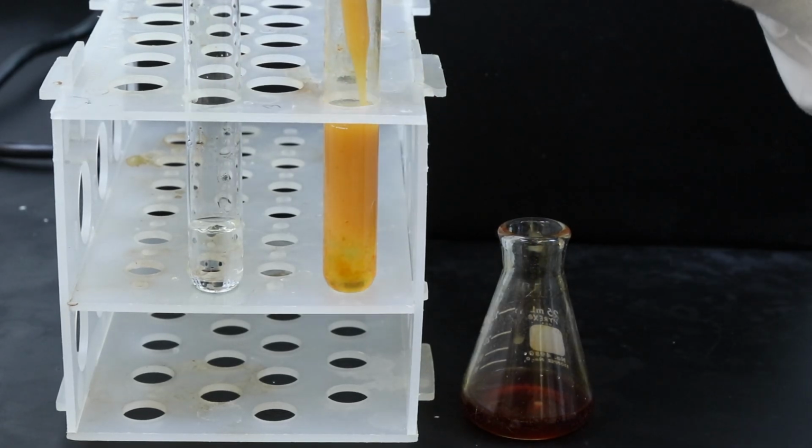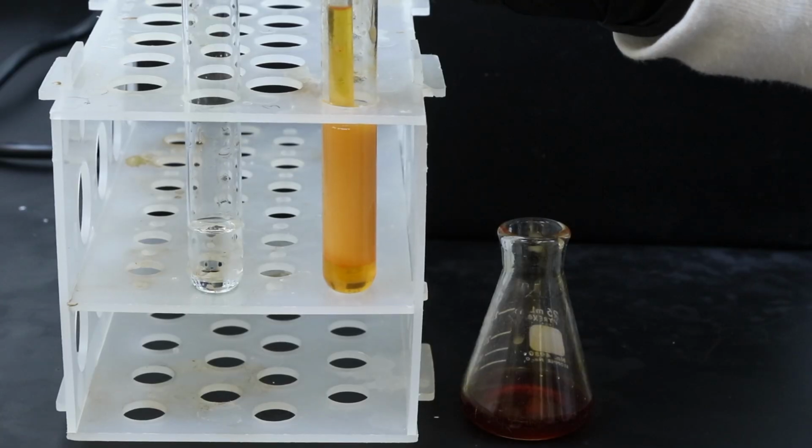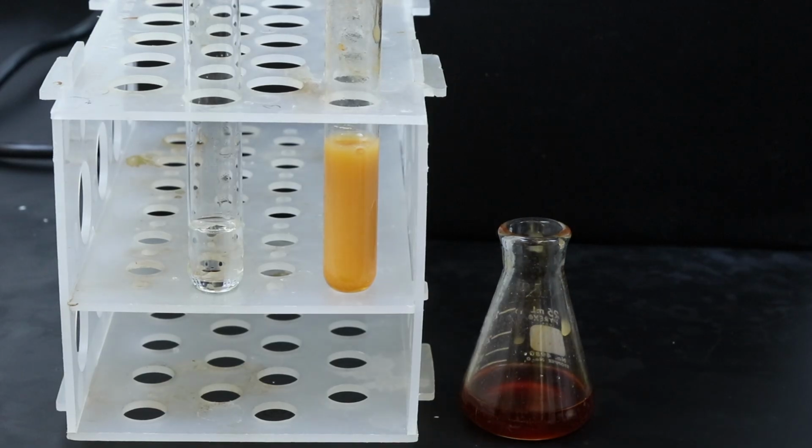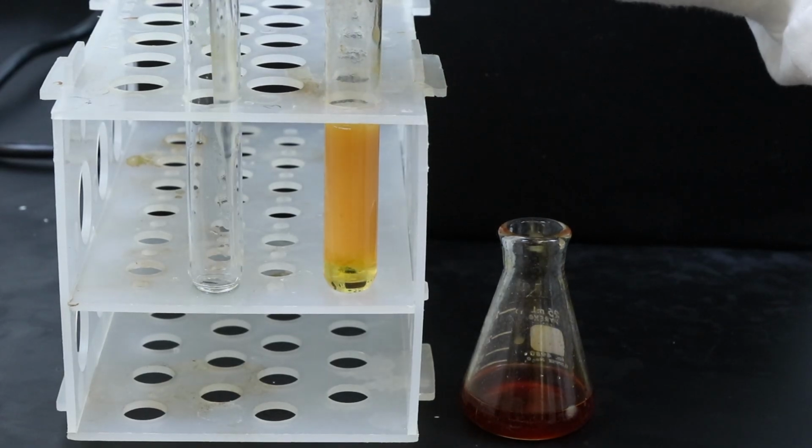And you can see as the extractions continue that the methylene chloride layer gets more and more dilute, meaning that there is less product to extract each time.